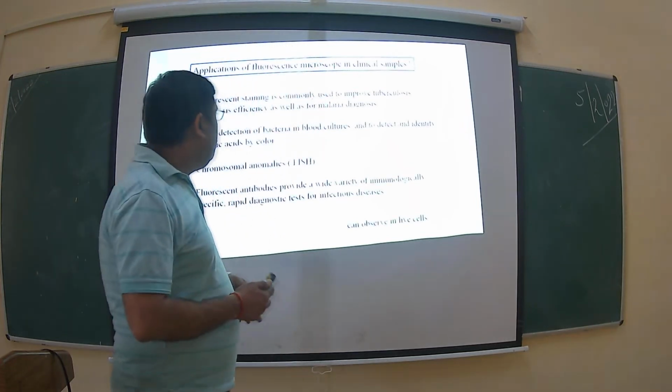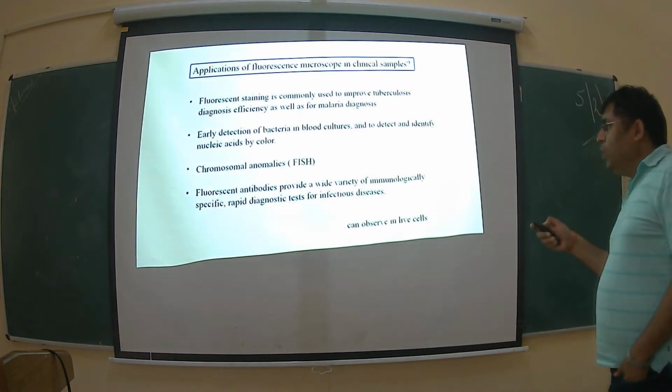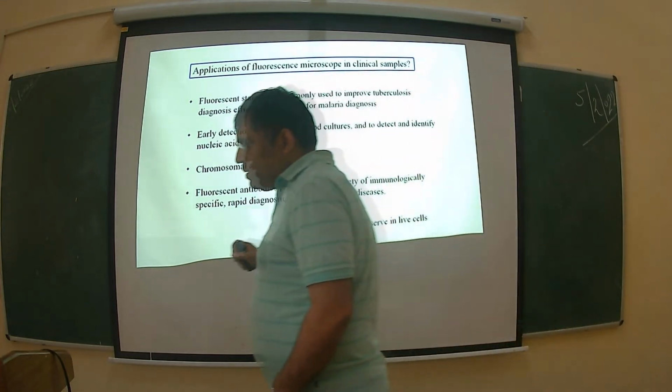Okay, so now see, I told you that fluorescent staining is commonly used to improve tuberculosis diagnosis.